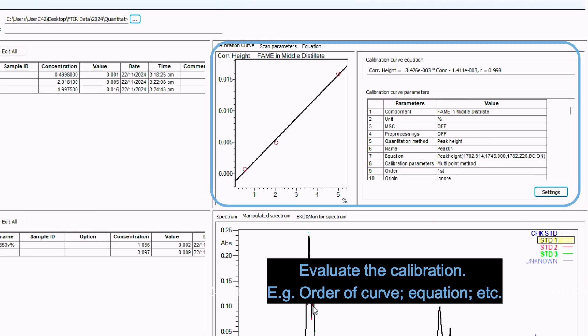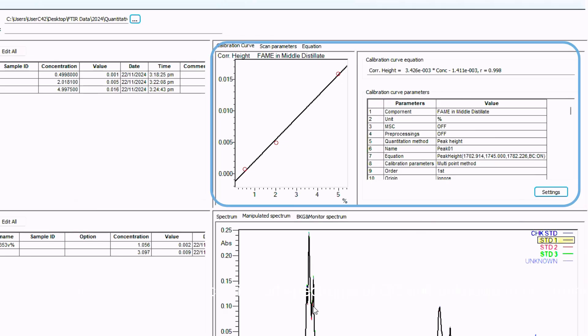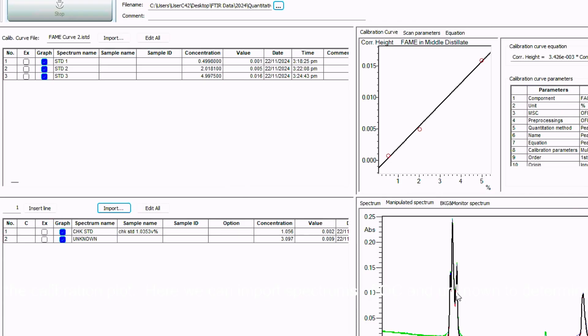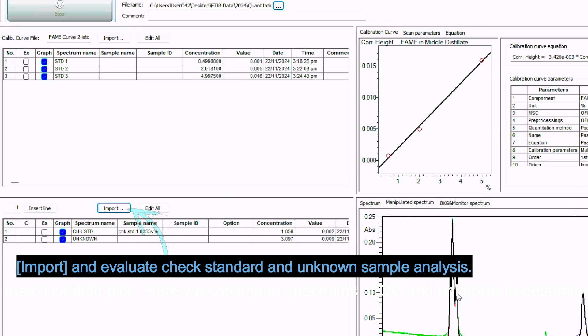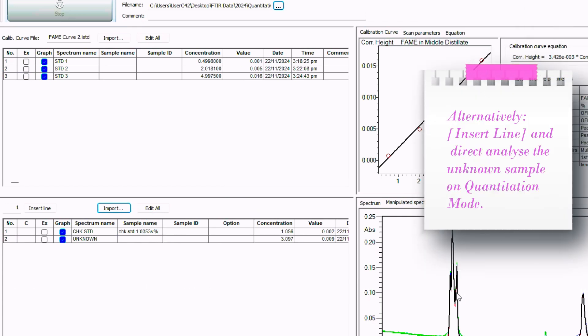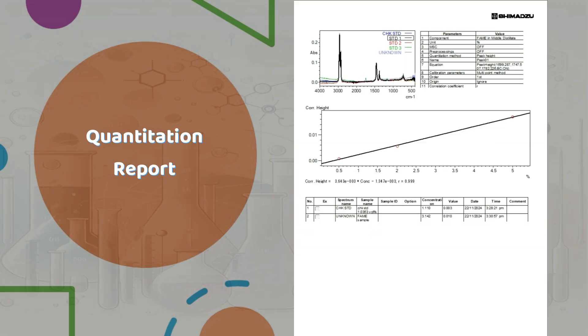Here we can check the calibration plot. Here we can import spectrums of QC and unknown samples to determine the concentration. There we have a quantitation analysis and evaluation on FTIR done using LabSolutions IR.